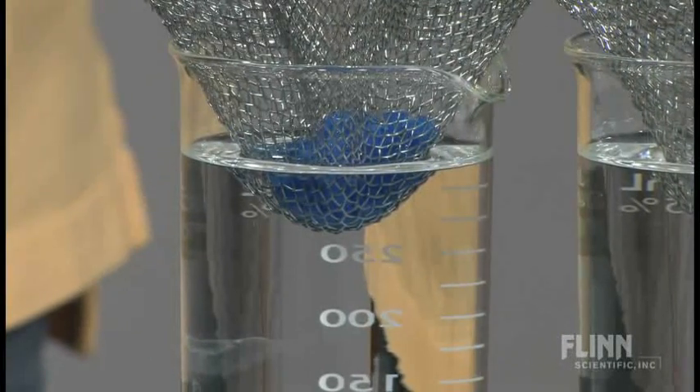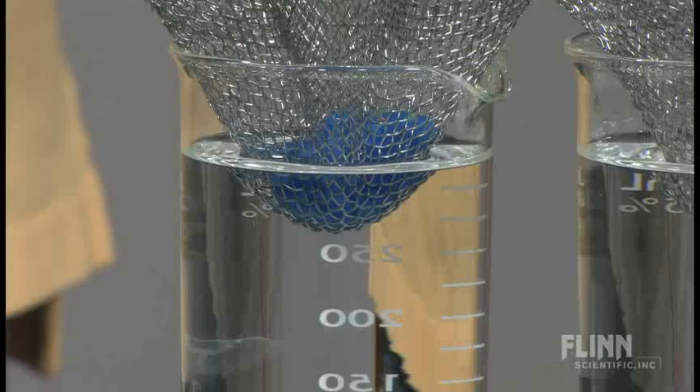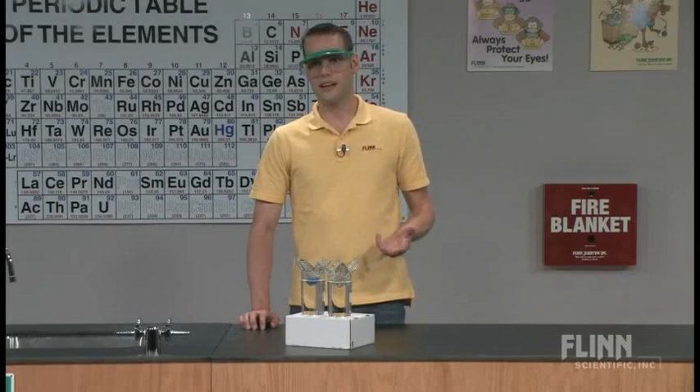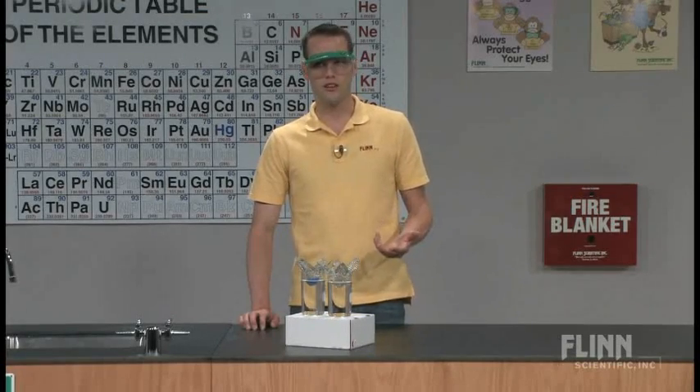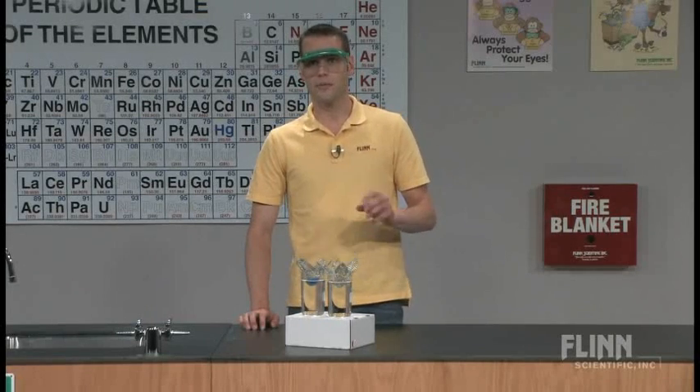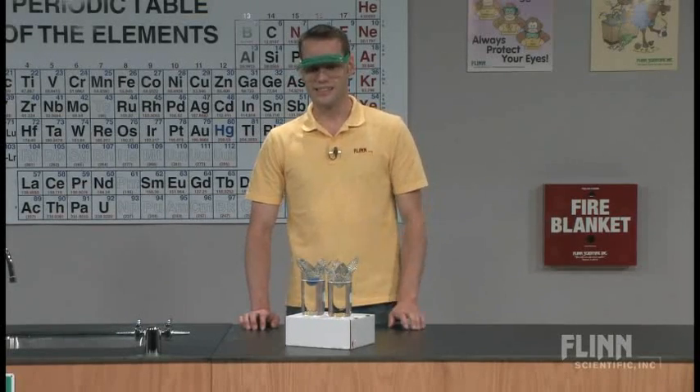We're going to take a time lapse of this reaction so you can see what it's going to look like over a series of a few hours. I encourage you to leave this set up for a few hours or even overnight in your classroom so the kids can see the crystal growth over time — it's not going to be an instantaneous thing.